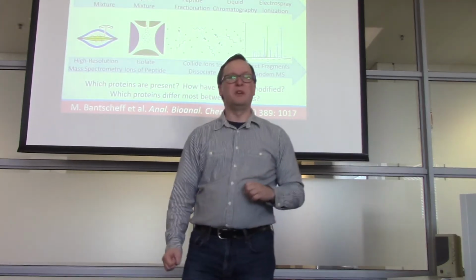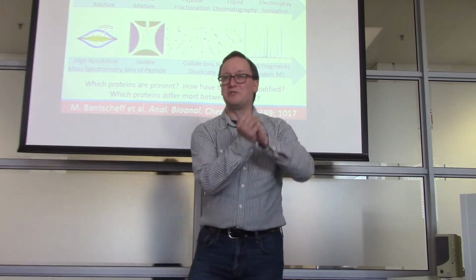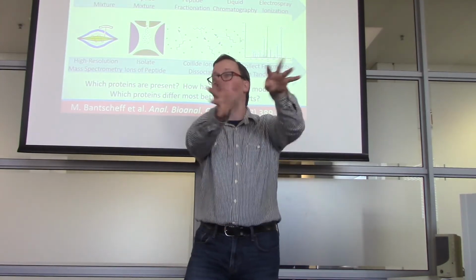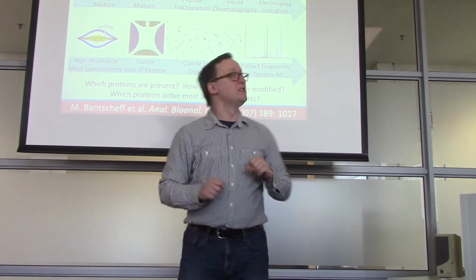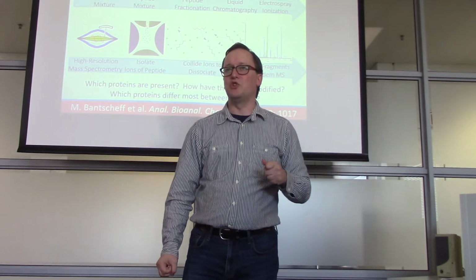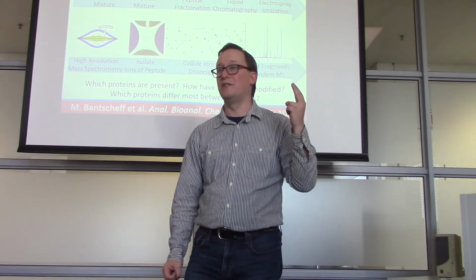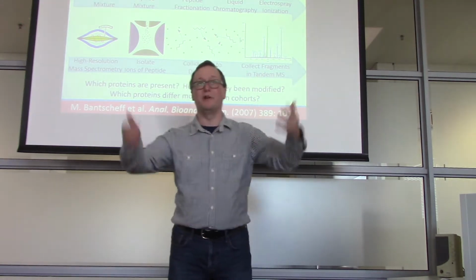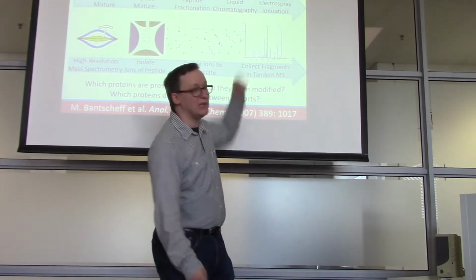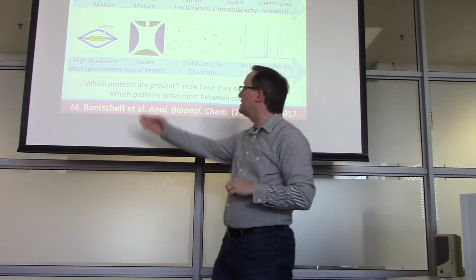Then we give them a good jolt. At this point you put several thousand volts on them and they produce this cloud of ions that can then pass into the mass spectrometer. So electrospray ionization was created by a guy named John Fenn several years ago. He was one of the folks who won the Nobel Prize for creating this science. All right, so electrospray ionization creates a cloud of these ions that are then drawn into the mass spec.